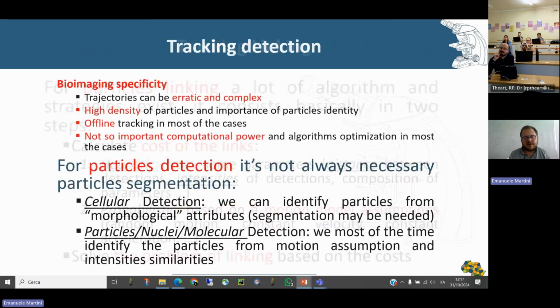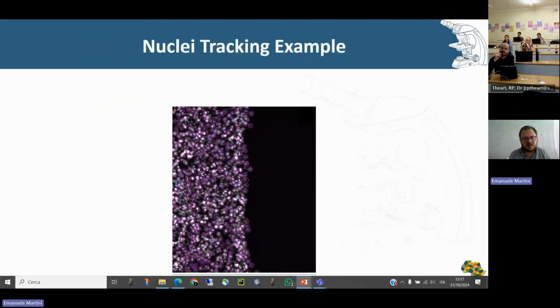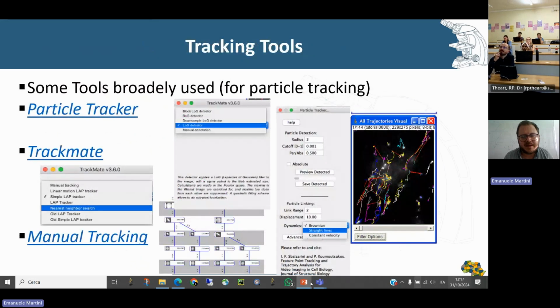Okay. And another thing, I will go back to the other slide, to this guide. What you can also see is that sometimes these algorithms are even more sophisticated. In the case of TrackMate, it also allows you to follow the phylogenesis of the cells, in the sense that you will be able to follow the mother and the daughters, see how the daughters move, and so also follow the duplication, the doubling of the cells.